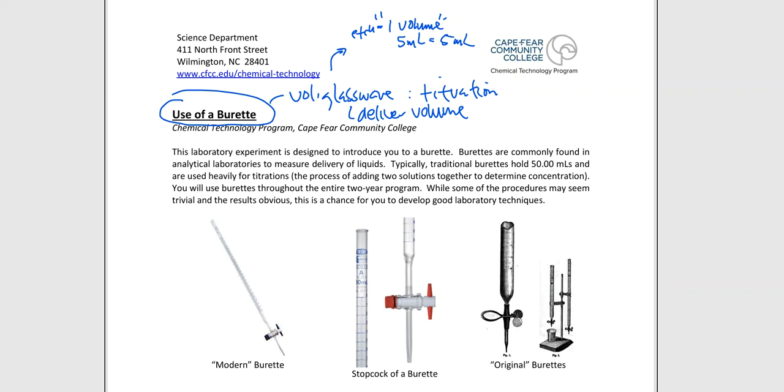So I need something that's a little bit more clever in design than a volumetric pipette might be. Okay, well, now you're thinking micropipetters. Yeah, micropipetters can be dialed up and they can dial down. So they are meant to deliver different types of volumes for me, but micropipetters are really going to stop traditionally at 1,000 microliters, which is 1 milliliter. And yeah, we've got automated pipetters, and we can go higher than 1 milliliter. They're not necessarily termed micro anymore, but we can at least go above 1 mil in a lab environment.